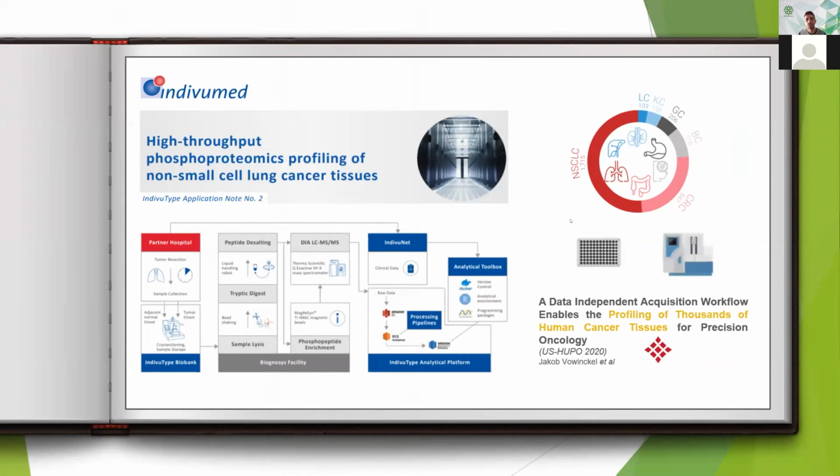And so now we are seeing these workflows applied in the clinical space, because of the ability to analyze large numbers of biopsies and biofluids in a robust manner. We hope that the combination of high throughput sample processing with efficient LCMS finally unlocks the full potential of proteomics when it comes to clinical applications.